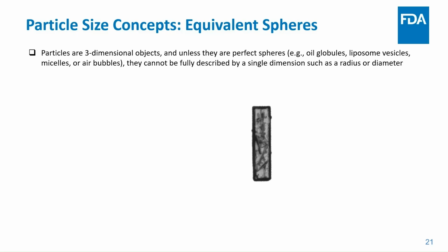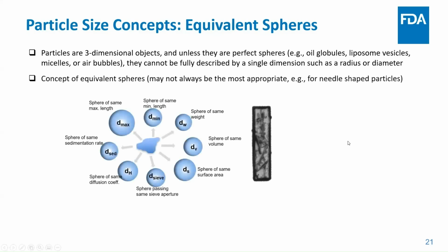That's the reason you will almost universally see, in the particle size measurement world, this concept of equivalent spheres. The reason is we have so much difficulty describing a three-dimensional object using anything but a sphere. So using the concept of a sphere, we can simplify the description of the particles: instead of describing by the different Feret, Martin, and other lengths, we cut it in half, the area equivalent.